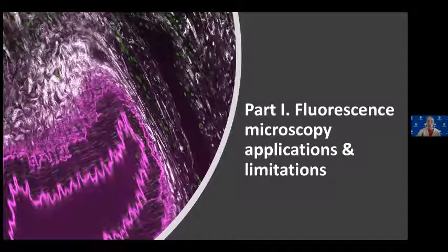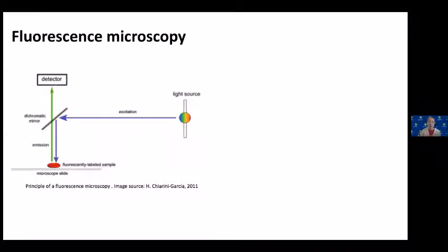Before I go to the details of those two projects, I first developed this section as an introduction to fluorescence microscopy basics, the applications, and also the limitations, to highlight what kind of limitations we have with fluorescence microscopy. Some of you may know about fluorescence microscopy. Here is just some basics about regular fluorescence microscopy. It is a group of microscopy techniques. Underneath it there are many different types, but the bare bones of it are very simple and highlighted here.